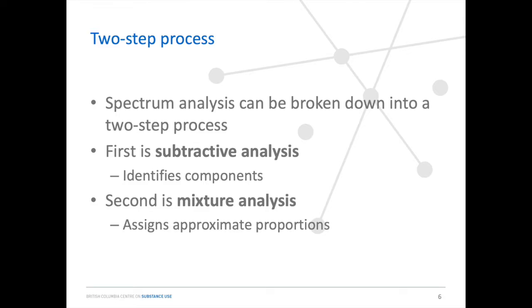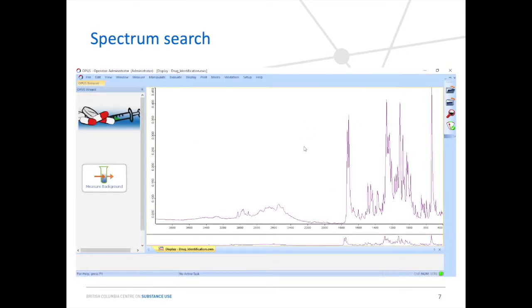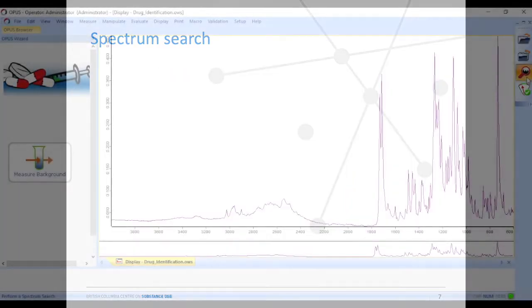We start on every sample with the subtractions. Pretty much all analyses you're going to perform on a spectrum can be accessed through this button, the spectrum search.